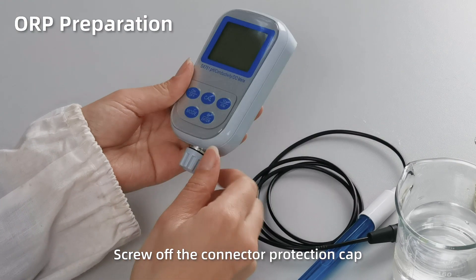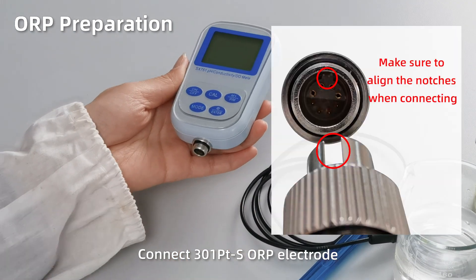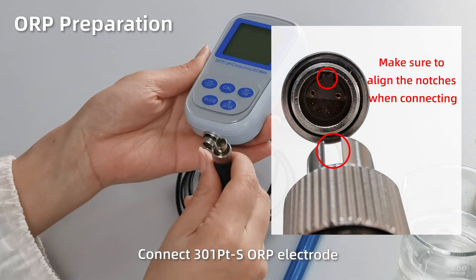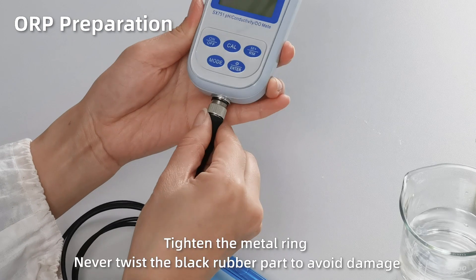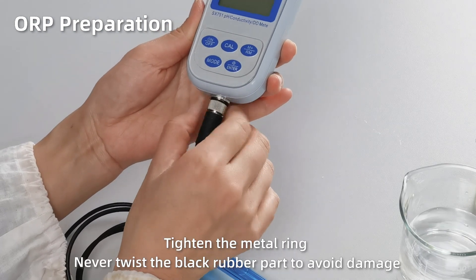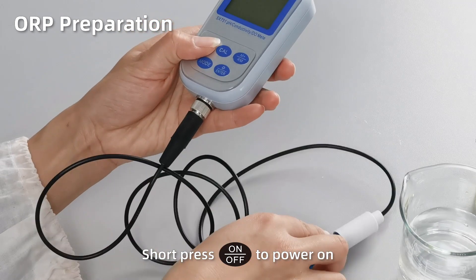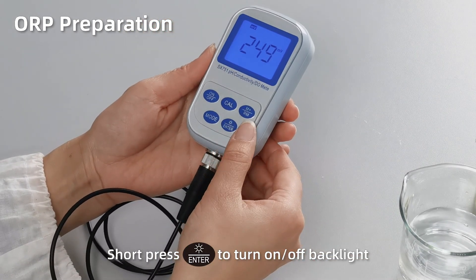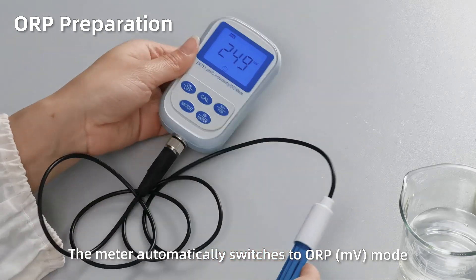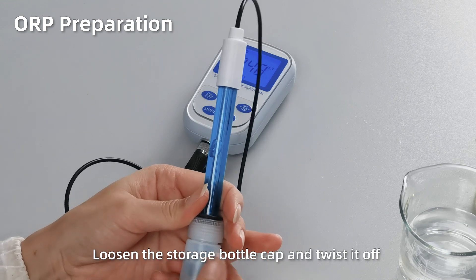ORP preparation. Open up the connector protection cap. Connect the ORP electrode, making sure to align the notches when connecting. Tighten the metal ring — never twist the black rubber part to avoid damage. Short press On to power on. Short press Enter to turn on or turn off the backlight. The meter automatically switches to ORP mode. Loosen the storage bottle cap and twist it off.